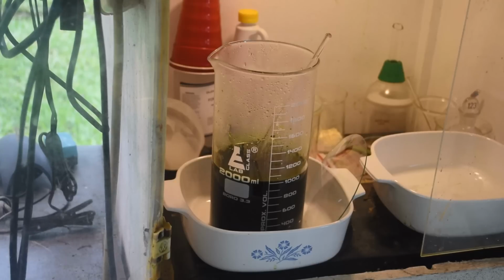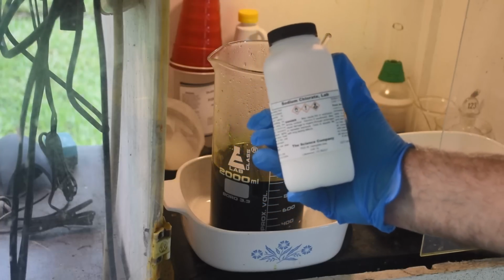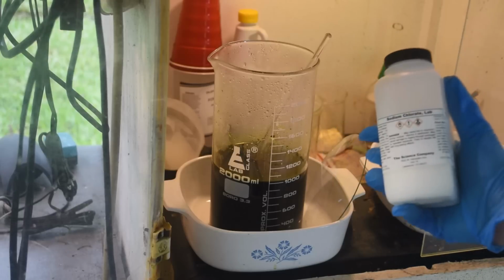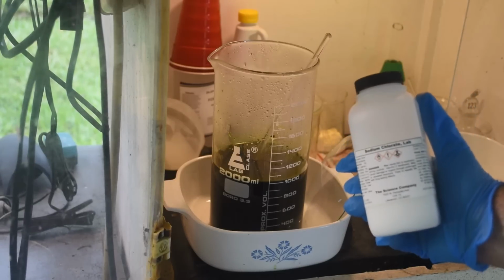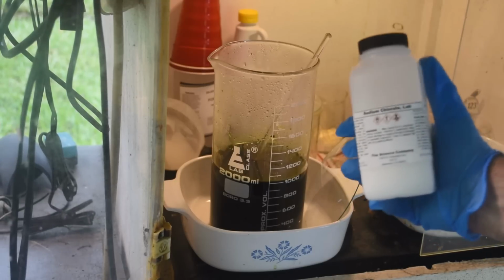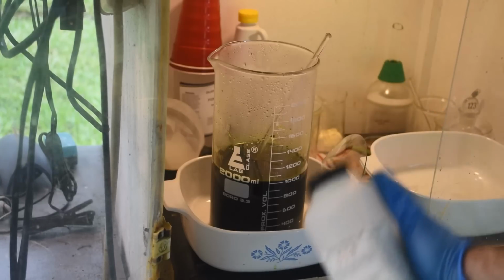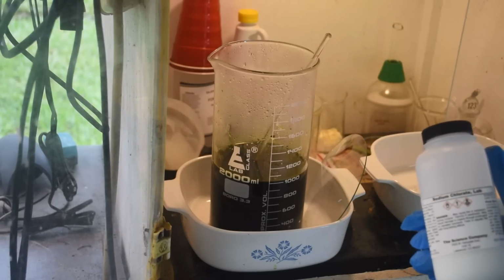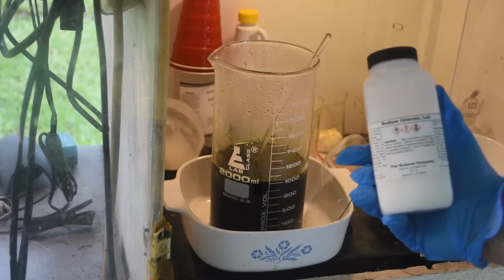Well, we're going to put some sodium chlorate in there. Not very much. This is the dangerous part of the reaction. This is going to react with the leftover acid in there, and it's going to create chlorine gas. And this reaction can be deceptively slow at first and lull you into thinking you can put more of this stuff in, and then it takes off like a rocket ship, and everything just bubbles right up out of your beaker, and big clouds of chlorine gas force you to go running. So yeah, we're going to be real conservative about this.